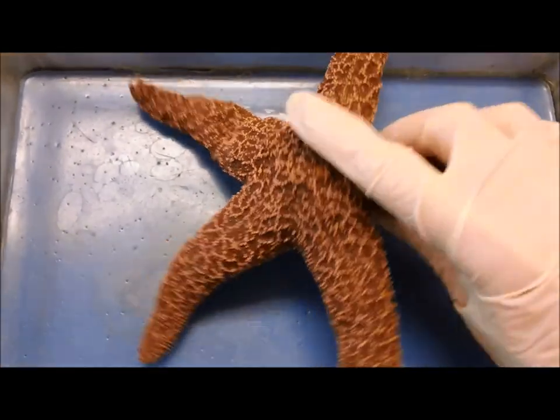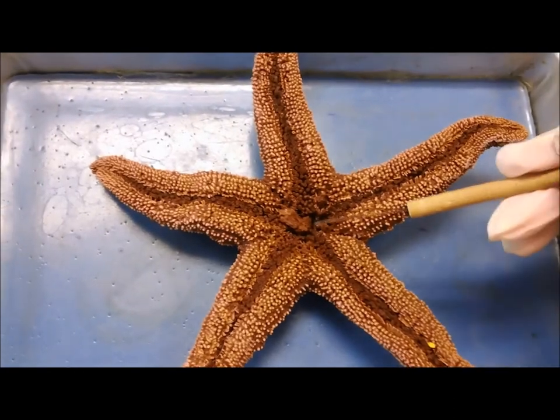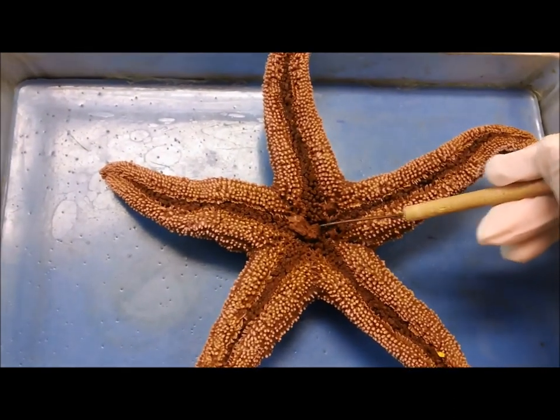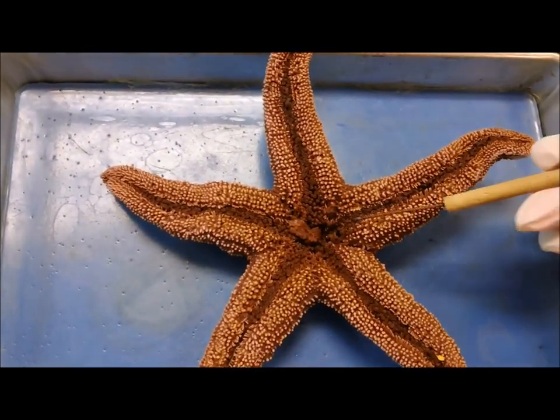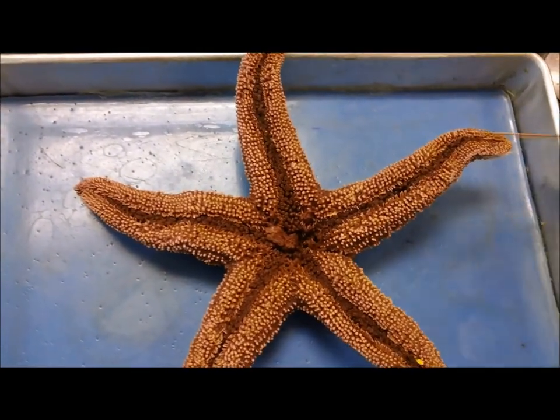You can turn it over to the oral side. The mouth would be right here. And the ambulacral groove with the tube feet on, running along the radial canal.